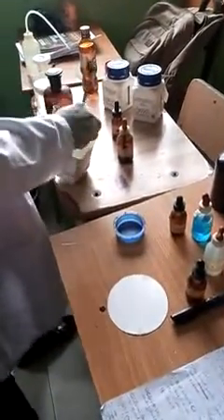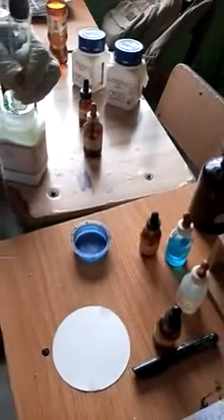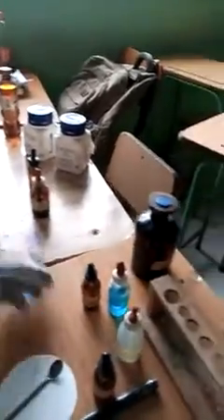So we're going to take a spatula full of the unknown salt. A spatula full. And then we put it into a test tube. So that is the instruction. Put it in a test tube. Say add about 10 cm cube of water.